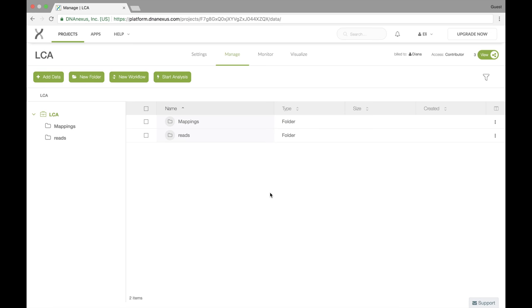Welcome! In the last video we talked about running individual apps. In this video we'll cover running a series of apps in a pipeline known as a workflow on the DNA Nexus platform.